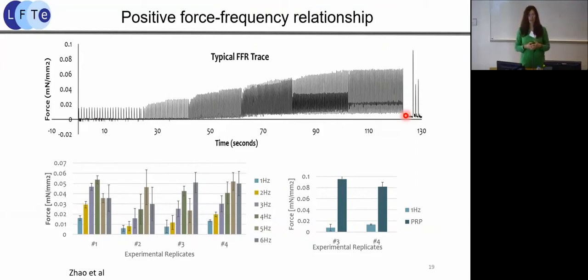And that's one of the reasons why if you just inject embryonic stem cell-derived cardiomyocytes into hearts of, let's say, pigs or monkeys, you can sometimes get very dangerous arrhythmia. It's because the cells have autonomous activity. So we're actually quite pleased with this fact that they don't beat if they don't receive electrical signals. And then when we turn on another slow stimulus, you can see this very, very high level of force, and that is called post-rest potentiation, and it occurs because of accumulation of calcium in the cytoplasm.